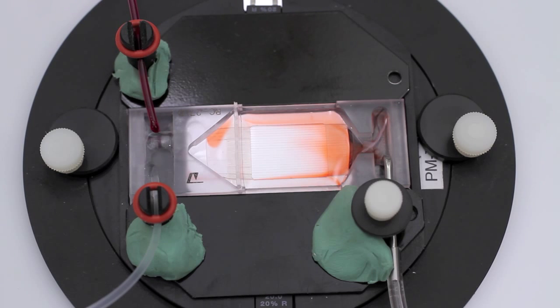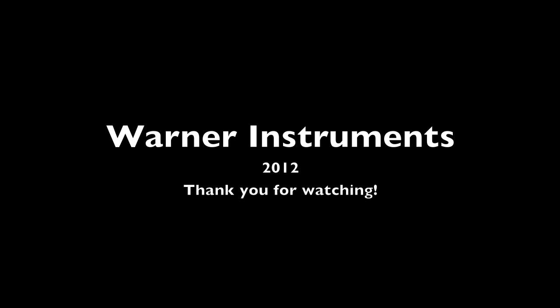A properly configured and assembled temperature-controlled perfusion chamber system with optimized perfusion and aspiration parameters yields a stable bath environment for the maintenance and study of biological preparations.